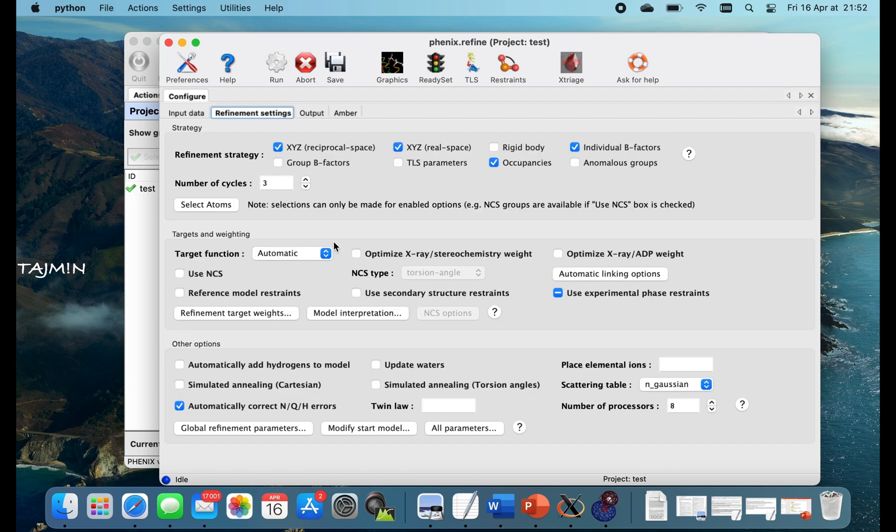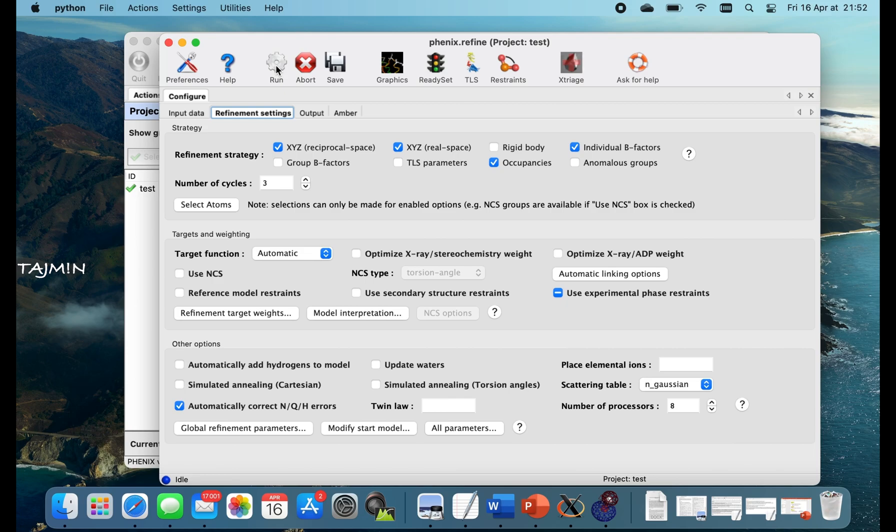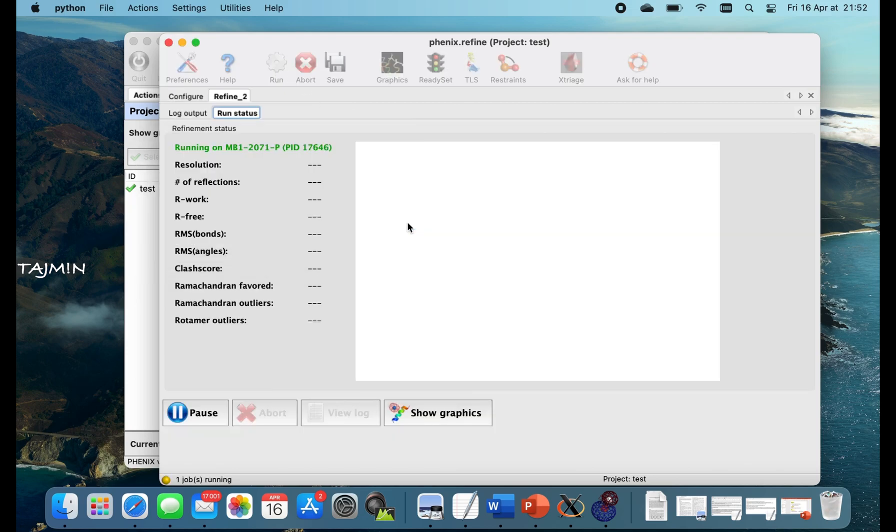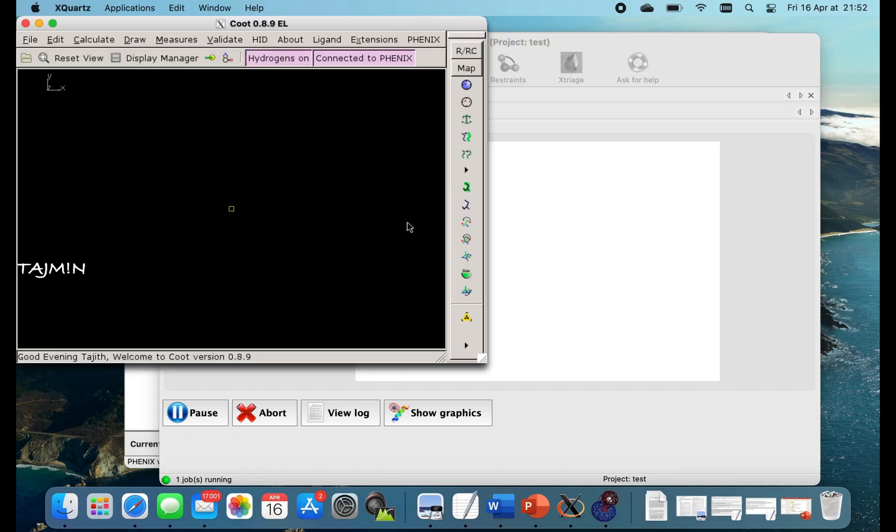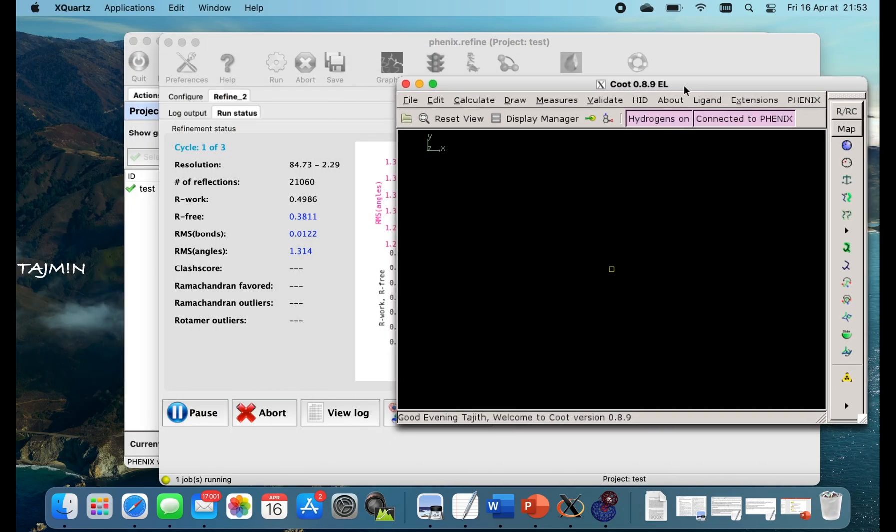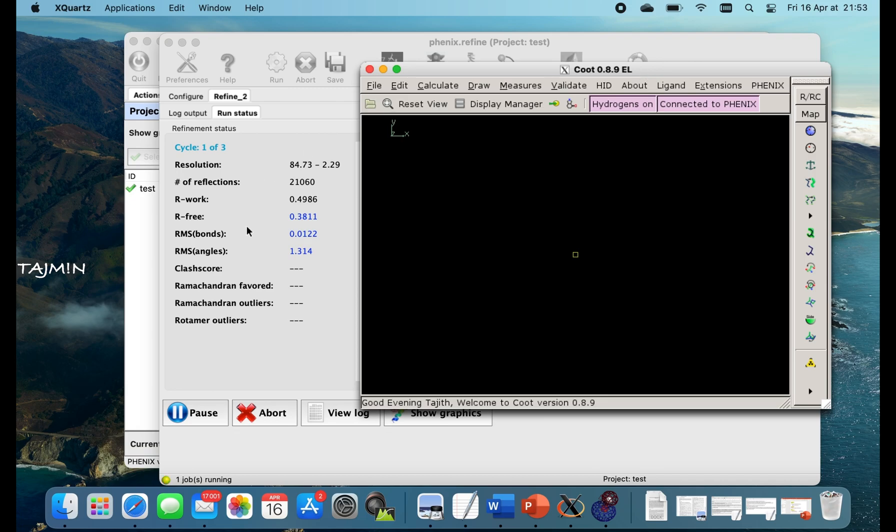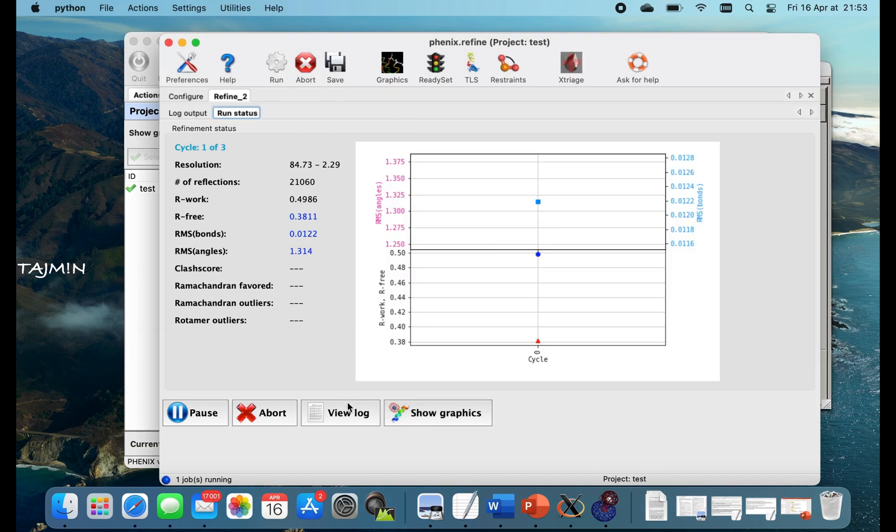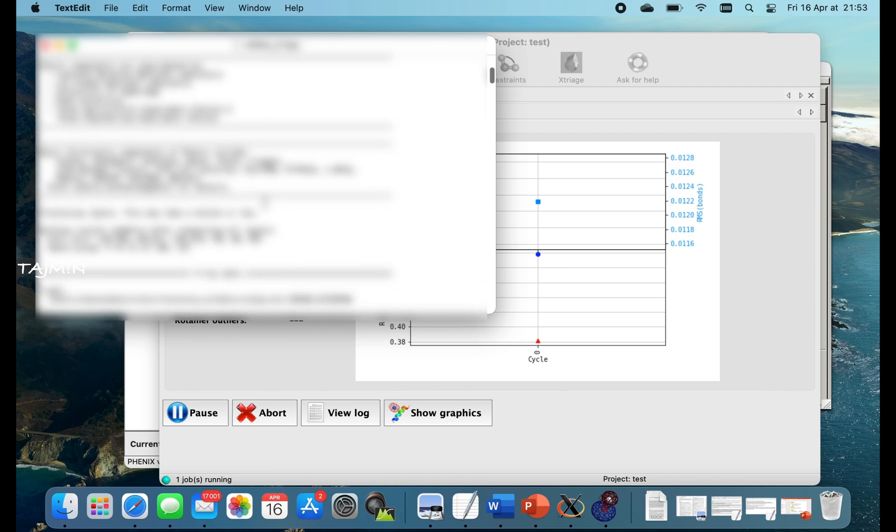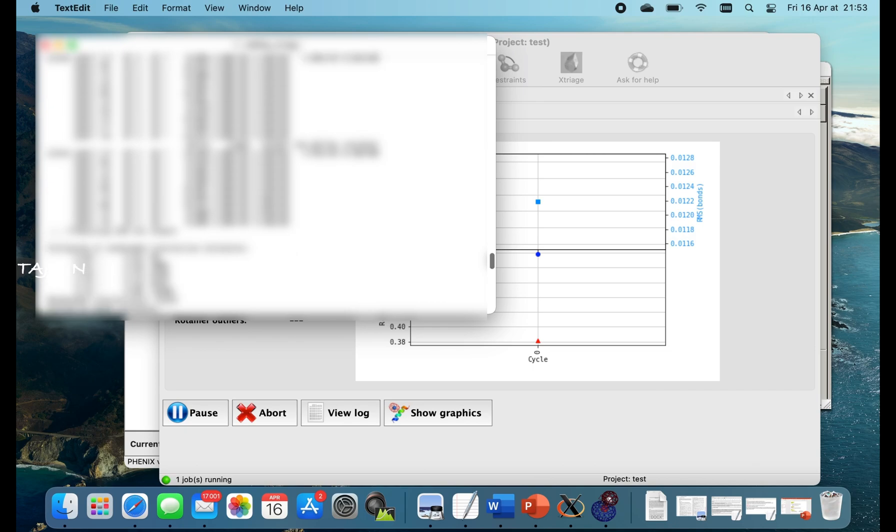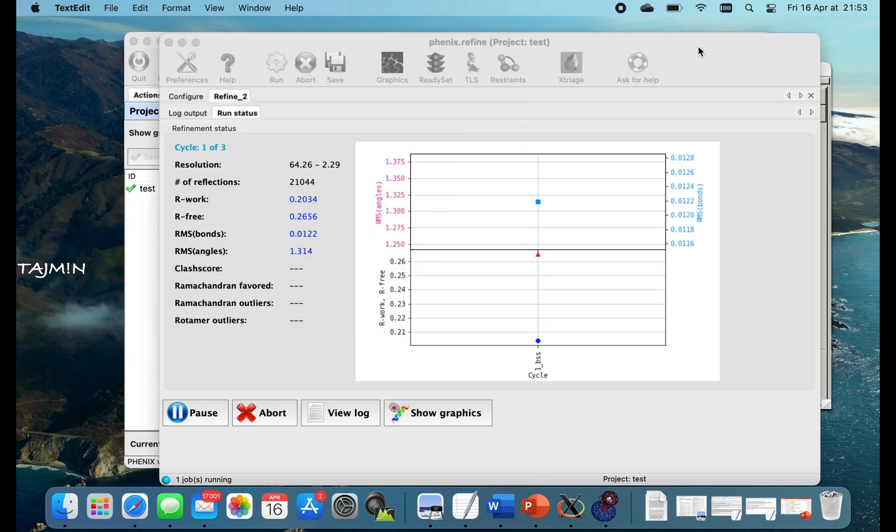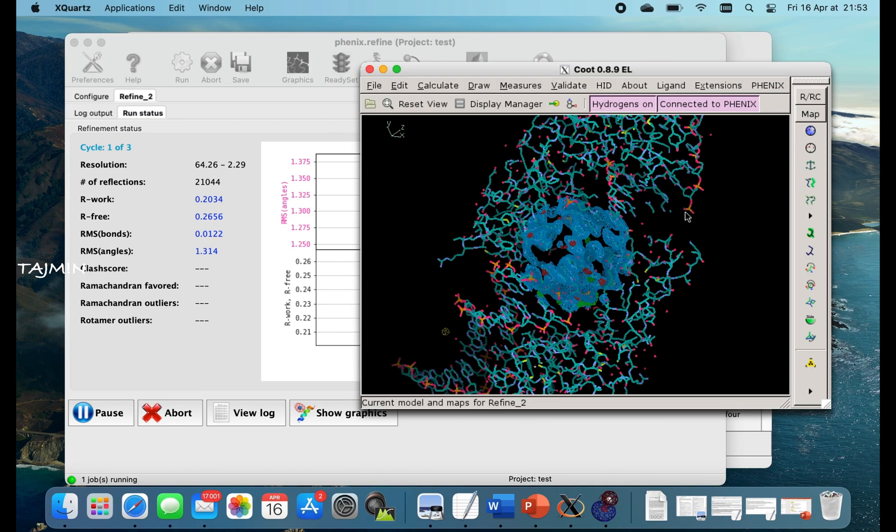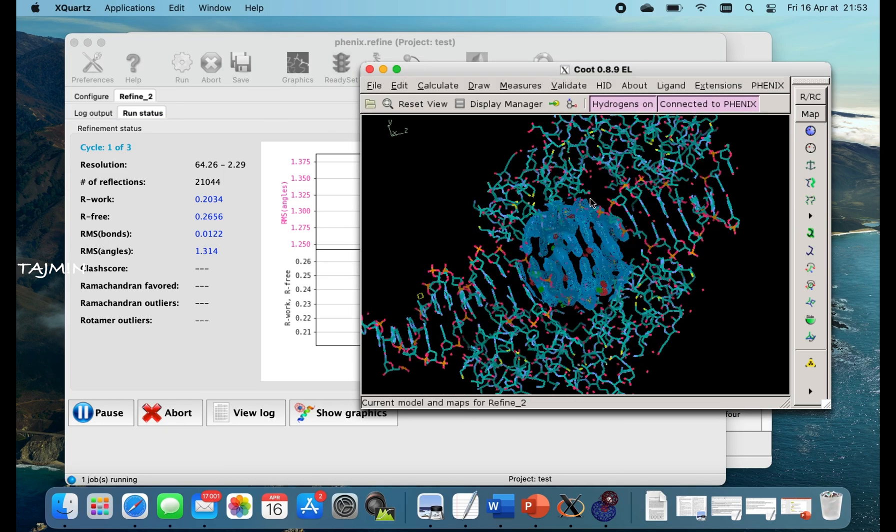Get back. So we keep the number of cycles to 3 and let's run. Coot is open instantly and let's have a look at the log file once. Then look back at the Coot window. The structure is loaded with the map.